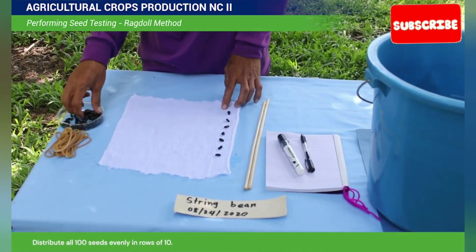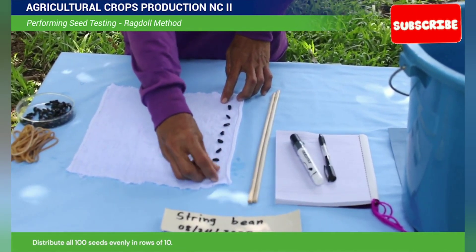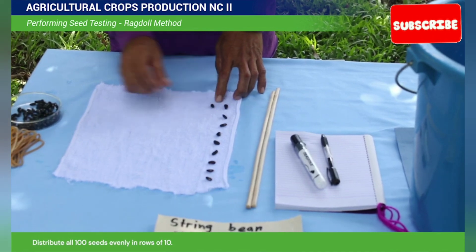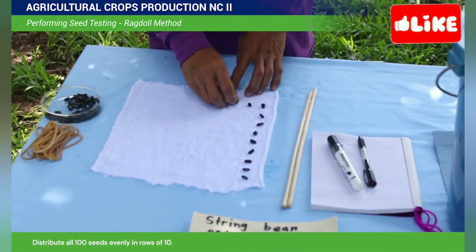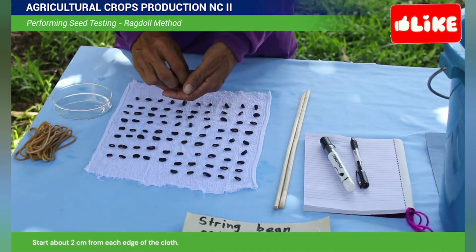Distribute all 100 seeds evenly in rows of 10. Start about 2 cm from the edges of the cloth.